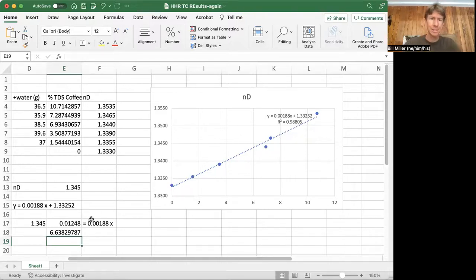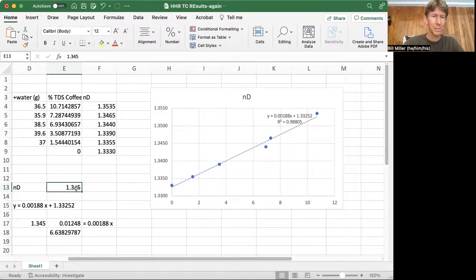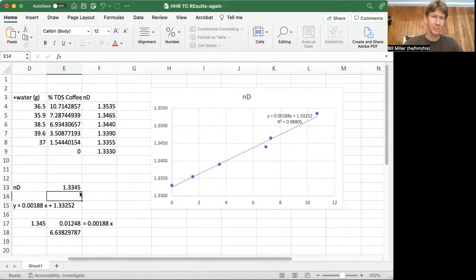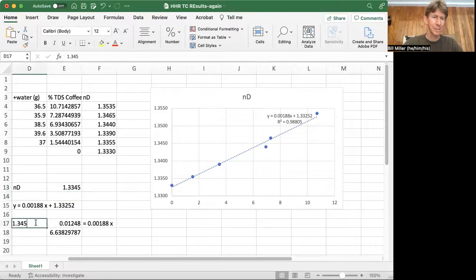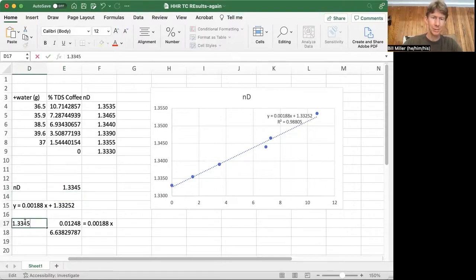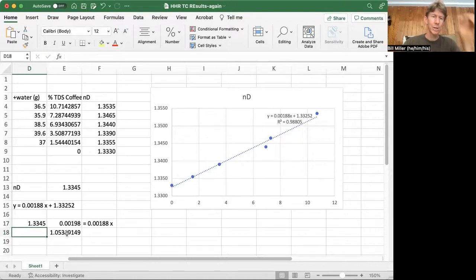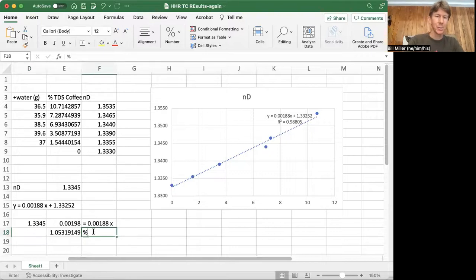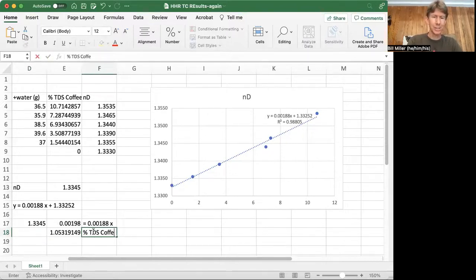Let's just plug this in. So 1.3345. 1.3345. 1.05%. That is my percent total dissolved solids coffee.